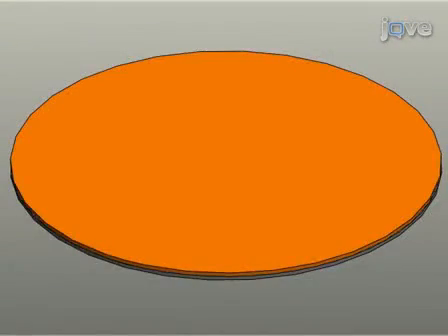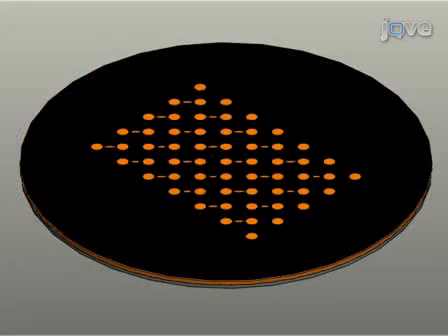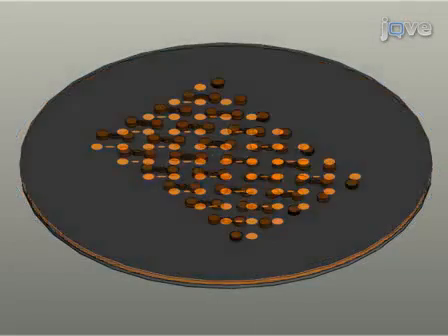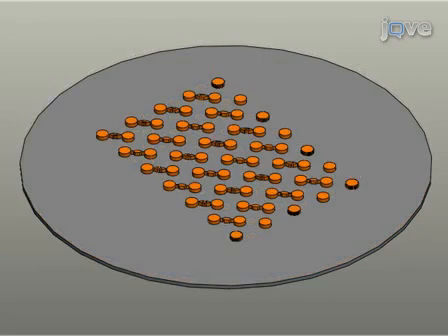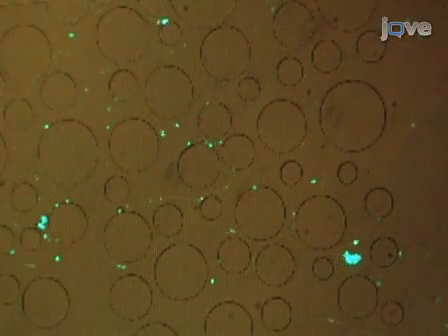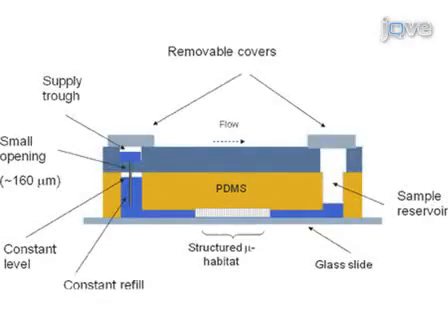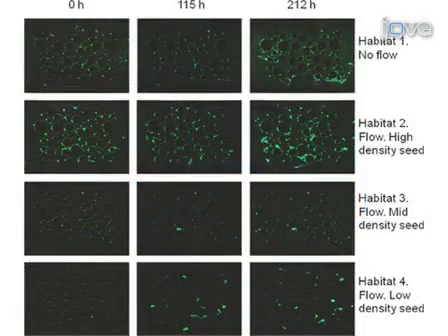We demonstrate that through use of eco-chip devices, physical structures and pressure heads can be held constant or varied, while the influence of surface chemistry, fluid properties, or the characteristics of the particles or microbes are investigated systematically. Through transport experiments using a non-pathogenic green fluorescent protein-expressing Vibrio bacterial strain, we illustrate the importance of habitat structure, flow conditions, and inoculum size on fundamental transport phenomena.